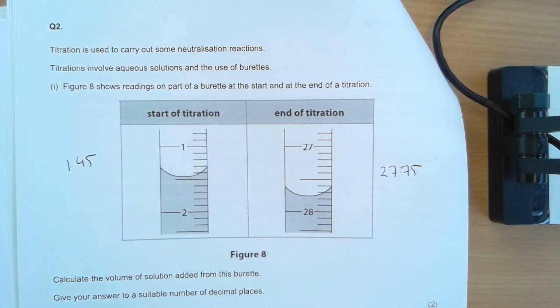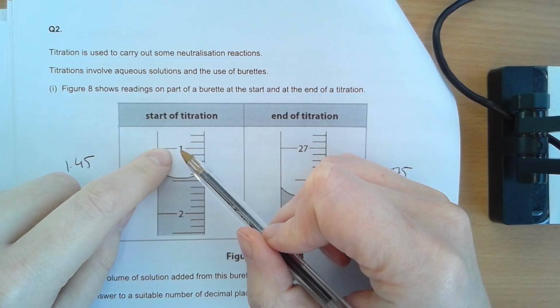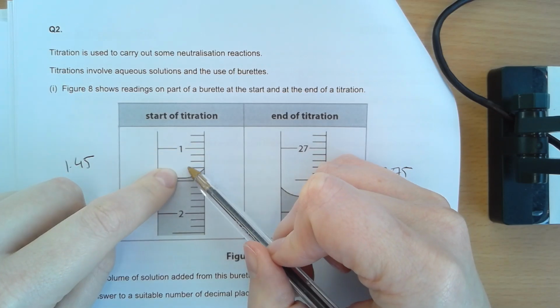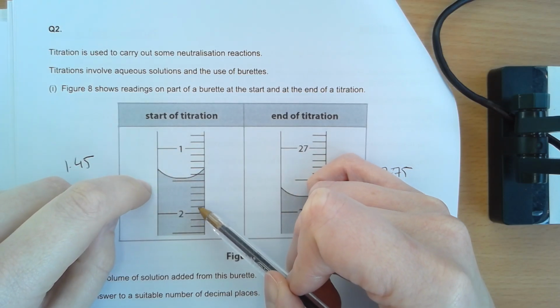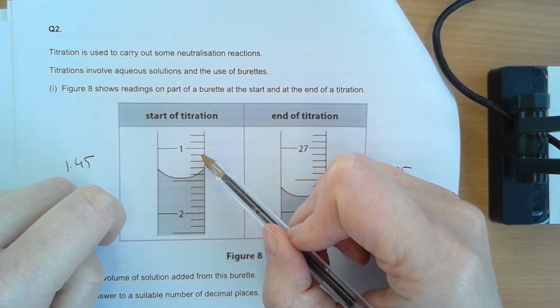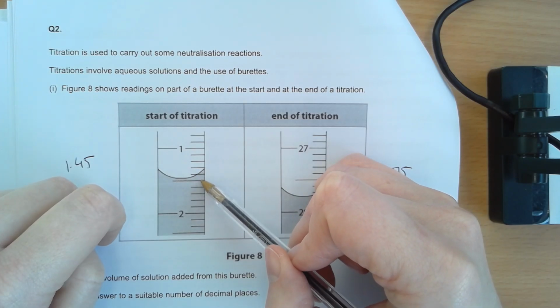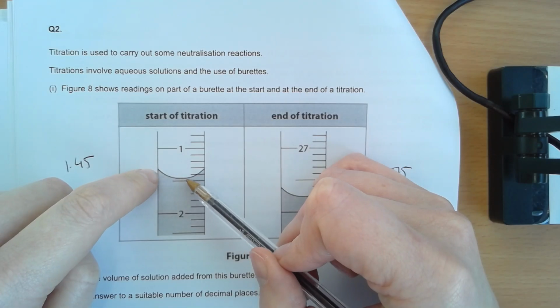Okay, if we just look at some other exam questions now, it's really important that you can actually read a burette. So here you can see it starts there at 1 and you're reading down, okay, so you're not saying that this is 2.55, you're reading down and you're saying 1.1, 1.2, 1.3, 1.4, it's not quite at 1.5, so you're reading it as 1.45.